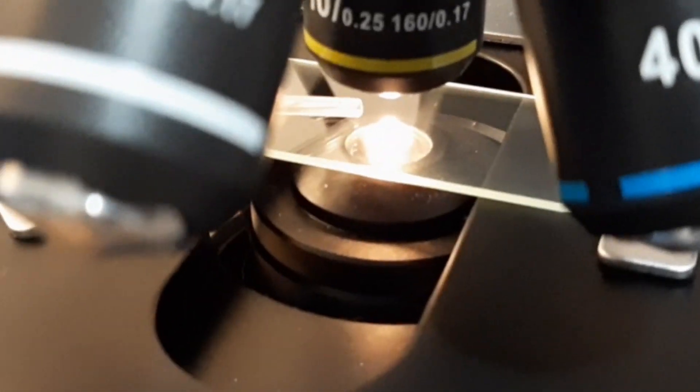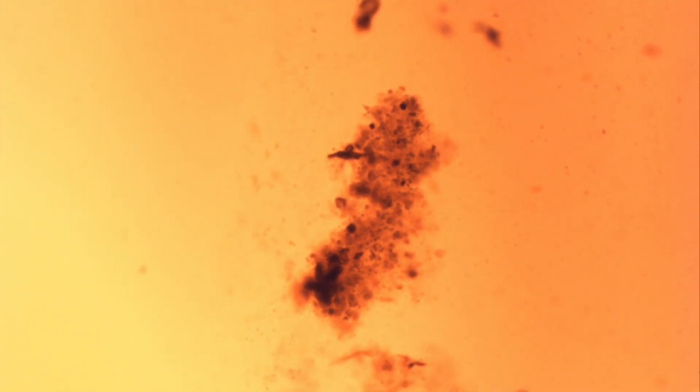First off, I will introduce a small drop of hand sanitizer to a small drop of water. The sanitizer changes the viscosity of the water and causes a real mess that made it hard to see what's happening. Still, once it calmed down, the once teeming water is now rendered lifeless.